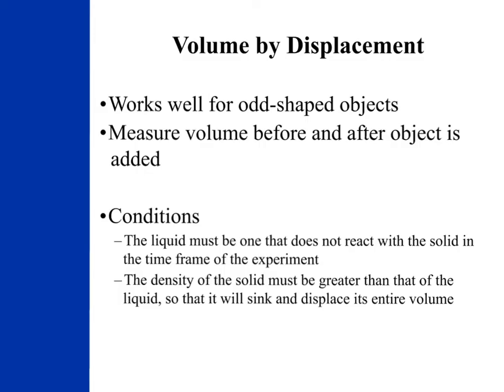The second condition is that the density of the solid must be greater than that of the liquid, so that it will sink down into the liquid. If it doesn't sink and if the solid's still floating on top of the liquid, then you're not truly getting an exact volume of that solid. So you have to make sure that your solid will sink in the solution or the liquid that you're using.